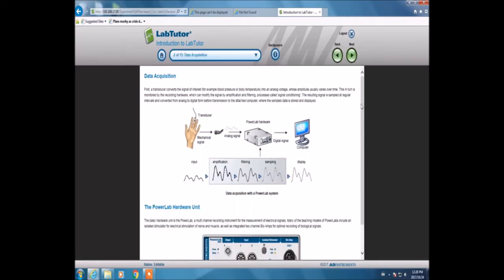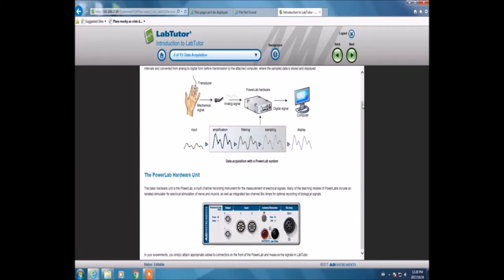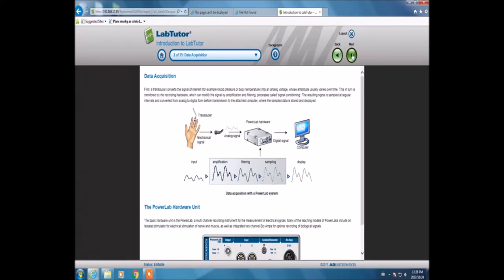This is the data acquisition center. The panel shows me how data is converted from mechanical to analog to digital data and then displayed.